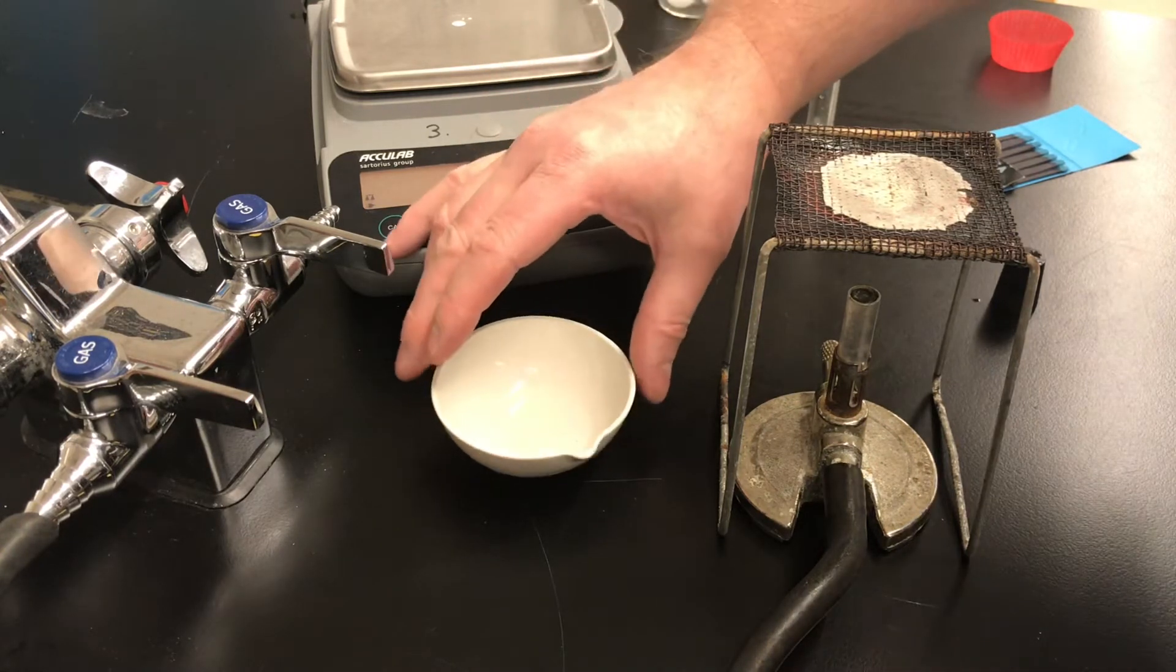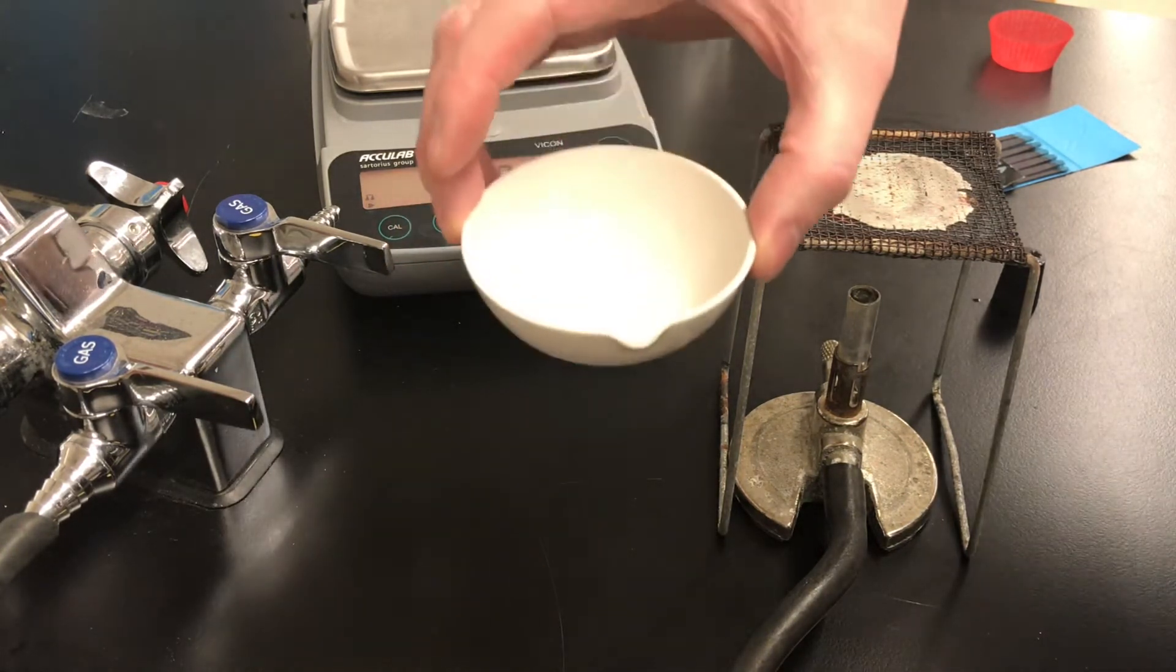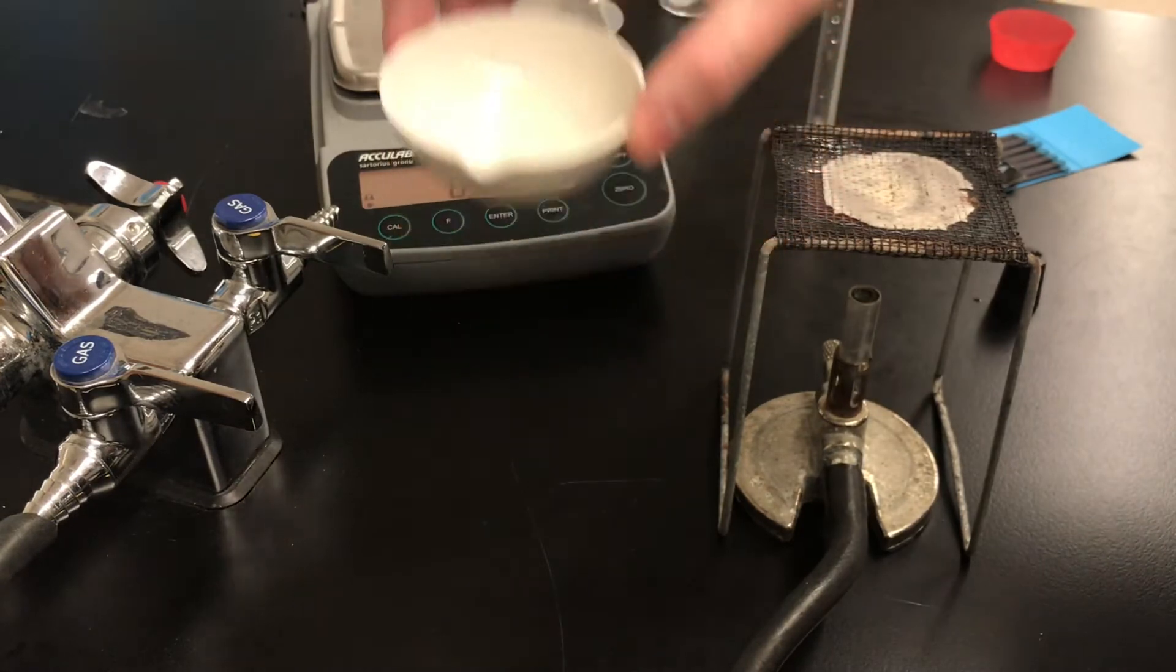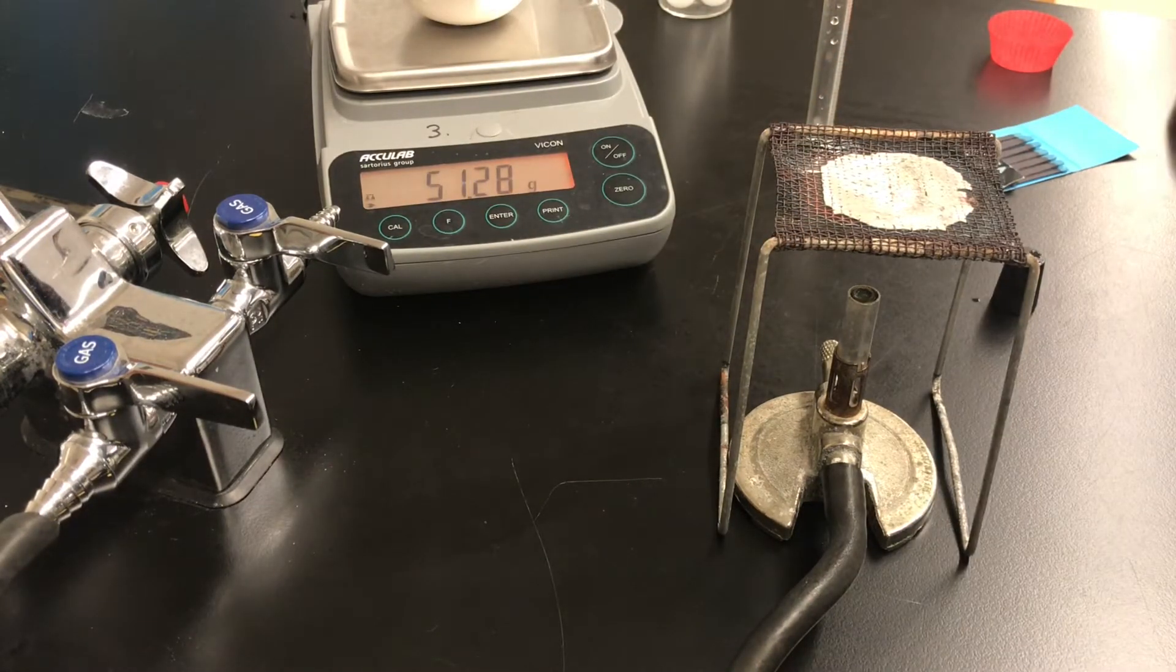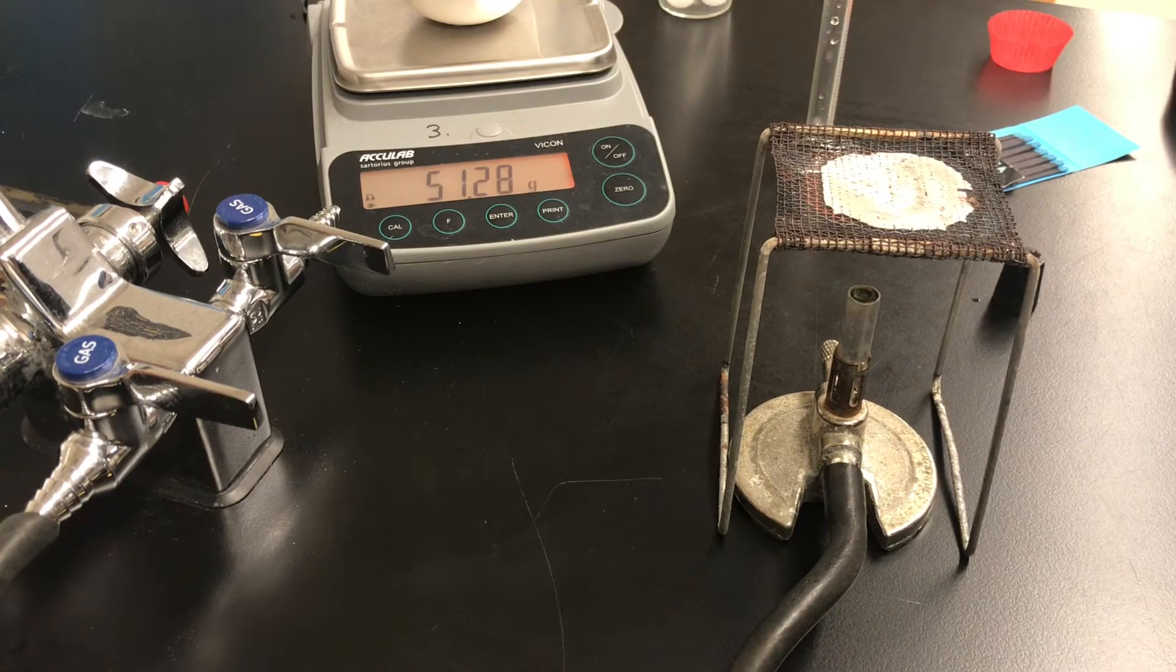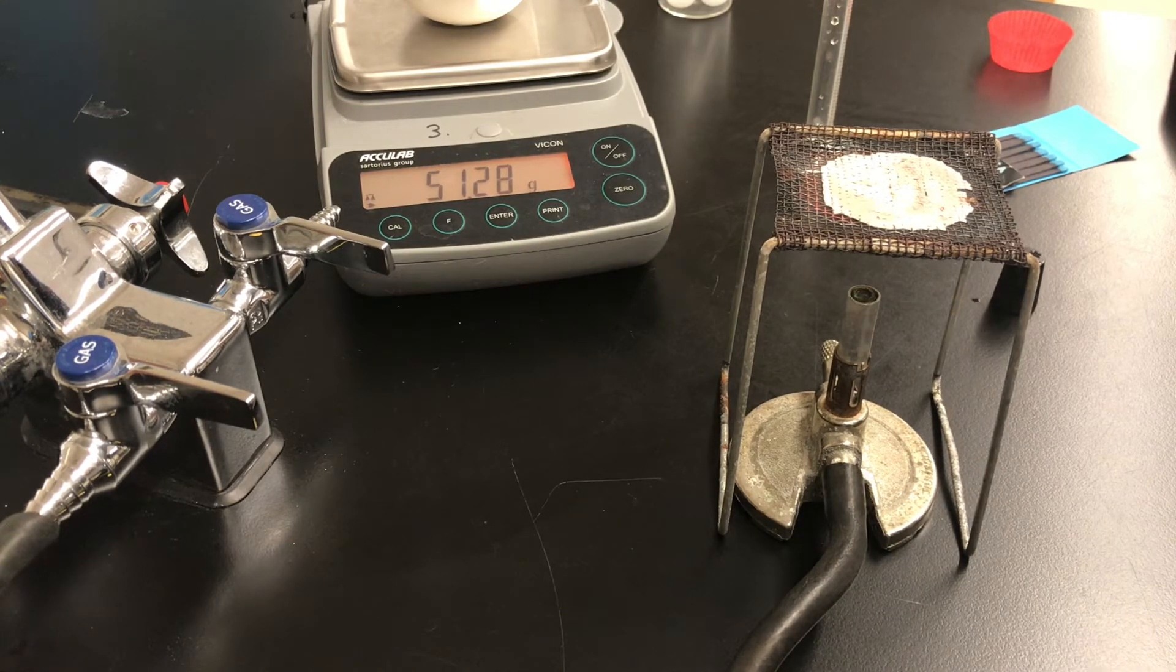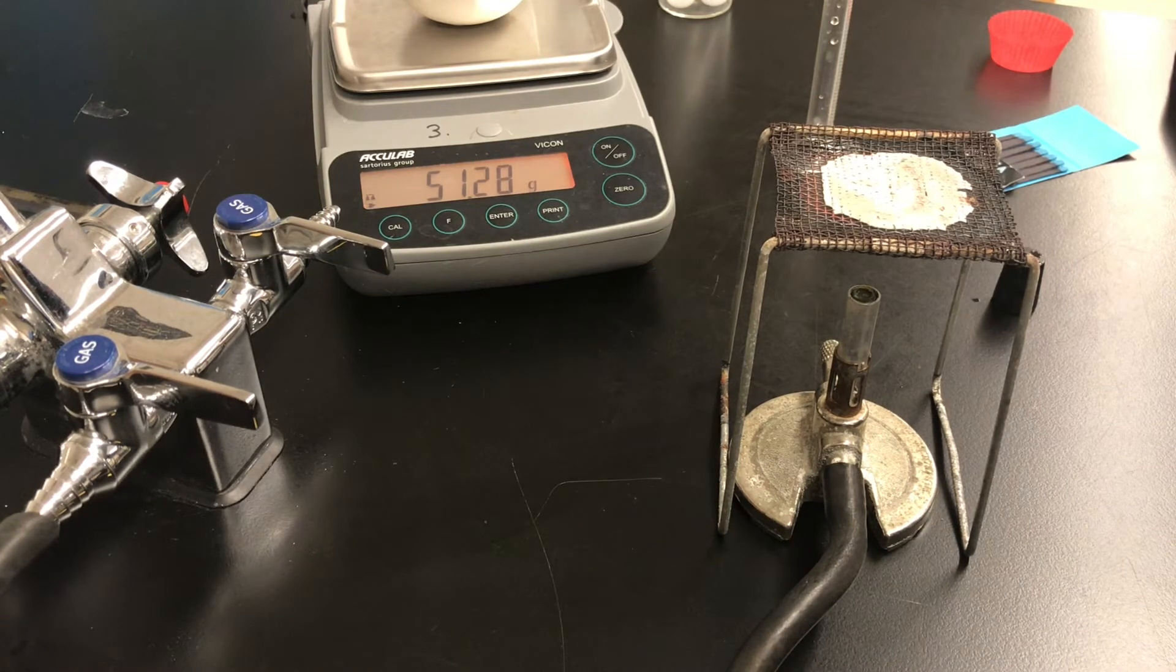Now the evaporating dish has some saturated solution in it. Let's look at the mass again. Record this mass in your data booklet. This is the mass of the evaporating dish with the saturated solution. It's about 51.28 grams.